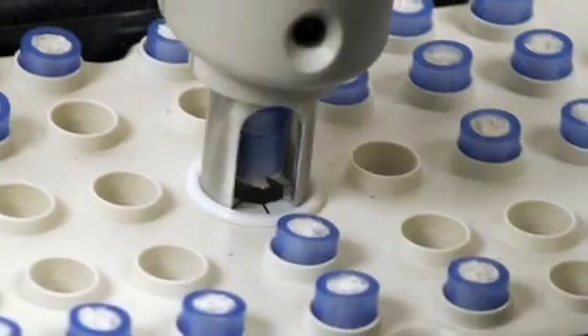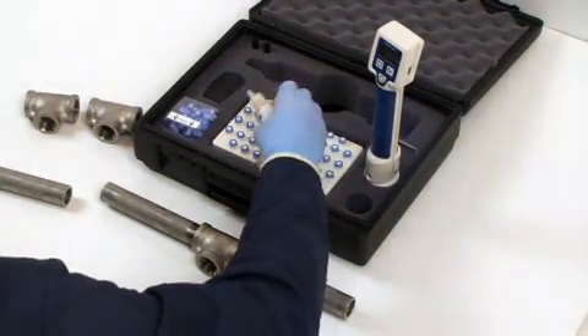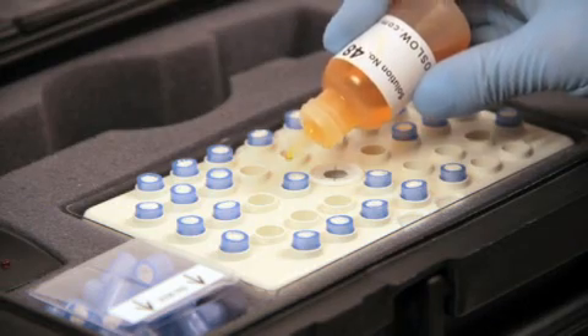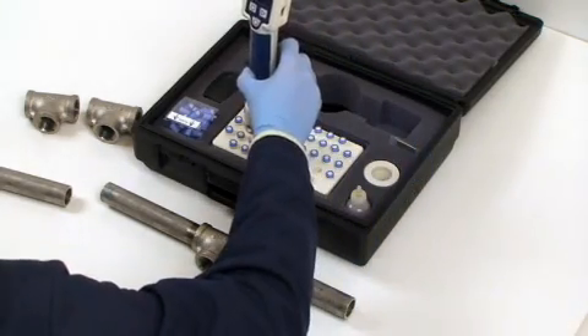This nib should now be removed, and you can start with your next nib. If you're doing multiple tests, you can moisten as many nibs as you like at one time. Each nib can be used up to five times.